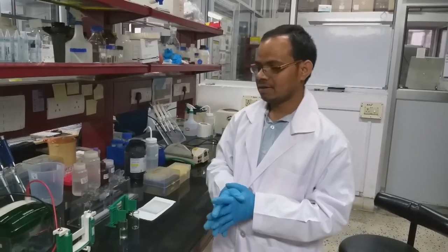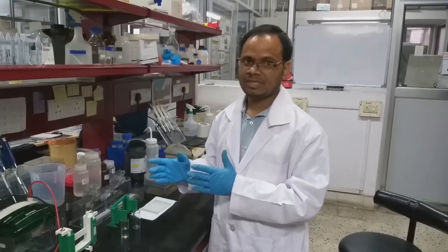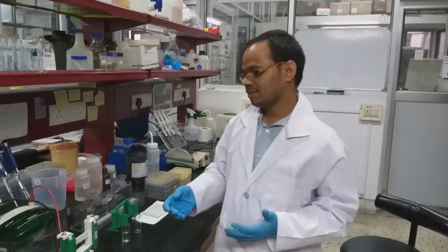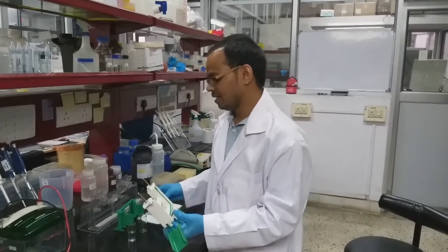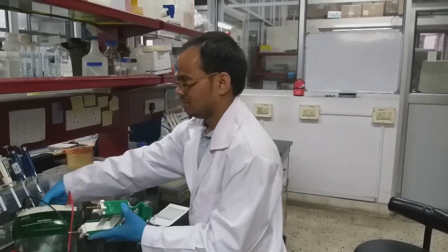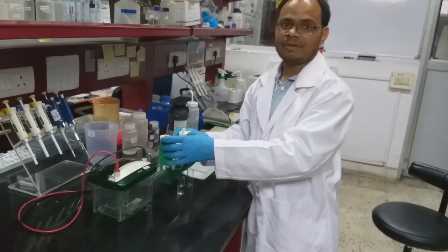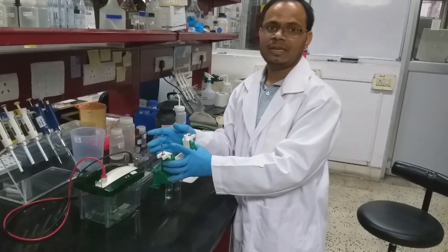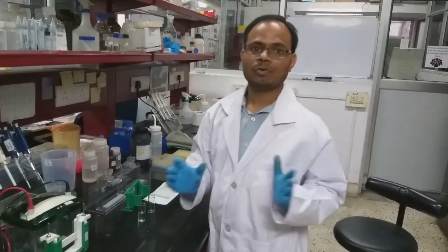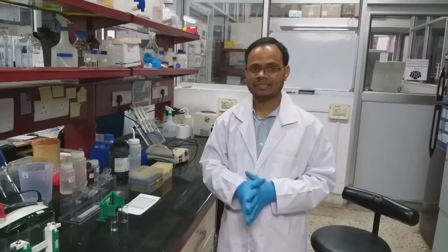After preparing the gel, we load the marker and the protein, which is denatured at 100 degrees Celsius for 3 minutes. After that, we fix this gel into this unit, fill the reservoir, then connect to the power pack and run the gel. So this is the overall introduction of how to prepare an SDS-based gel.